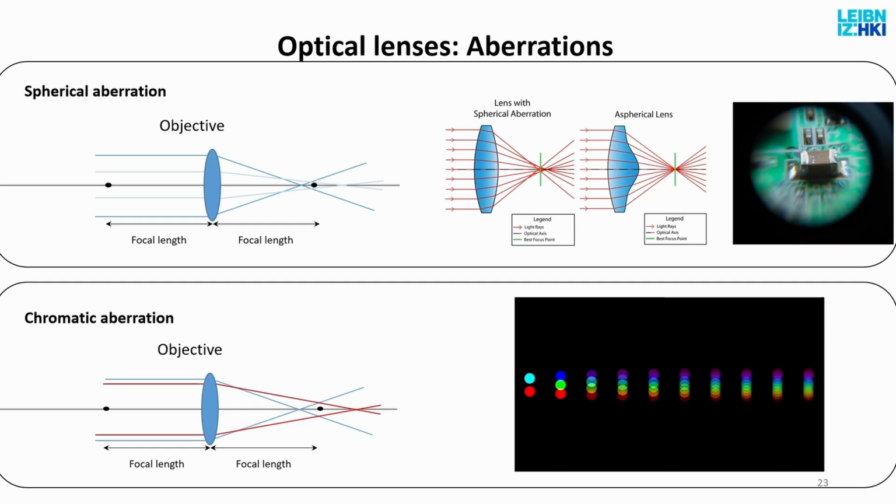And then you take an image with the different colors that you will use for your biological sample, and you check in your images, the 4 different images, blue, green, red, etc. Do they overlap or not? You do it in 3D, so you also see the axial shift. And if they don't, then you will at least know that my focal point in blue is a micrometer away from my focal point in red. So if I see in my images that my actin and my mitochondria are a micron apart, then I know that they actually do overlap.